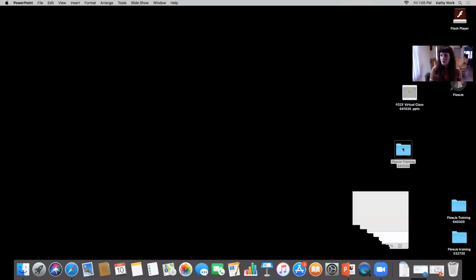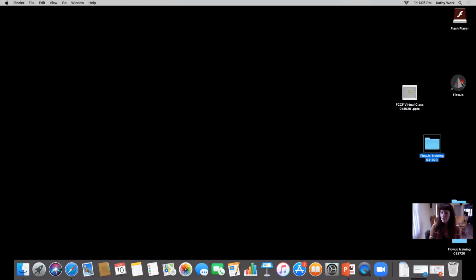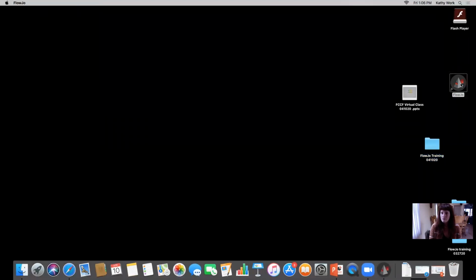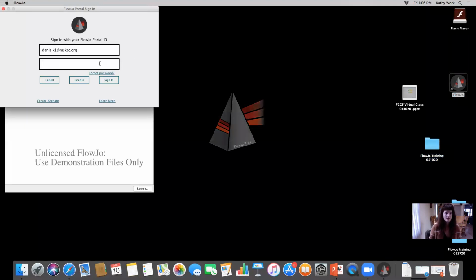Okay, so now we can go ahead and start looking at some data. I'm going to move myself a little bit down here, and go to my FlowJo icon on the desktop. Most people are aware of this, and I'm sorry if I repeat it every week, but I want to make sure our new attendees know that FlowJo now mostly works from a portal ID login. It's not a hardware-based login, but rather a portal ID if you're working from an individual license.